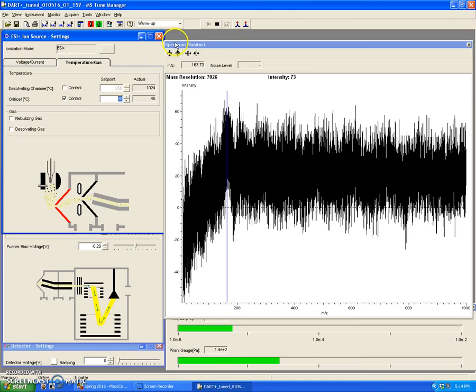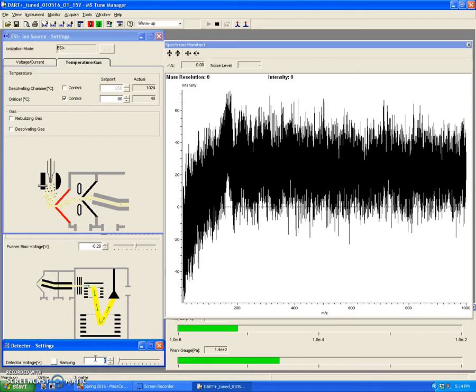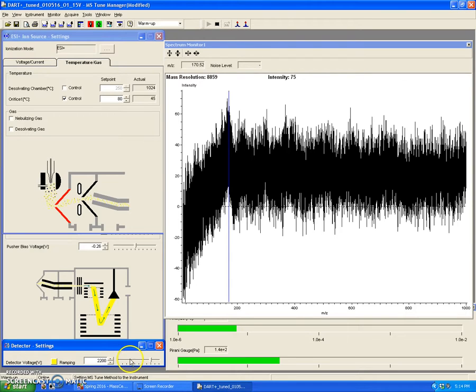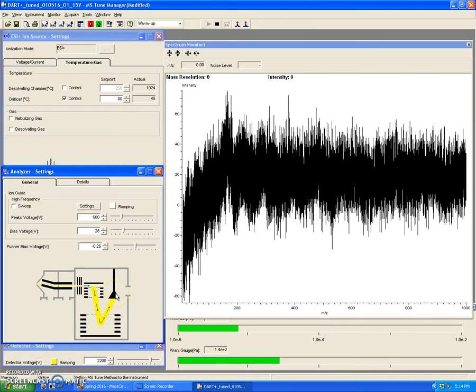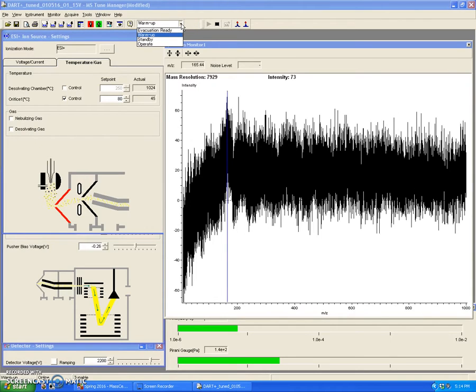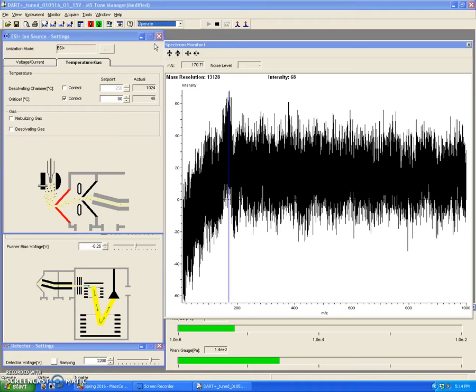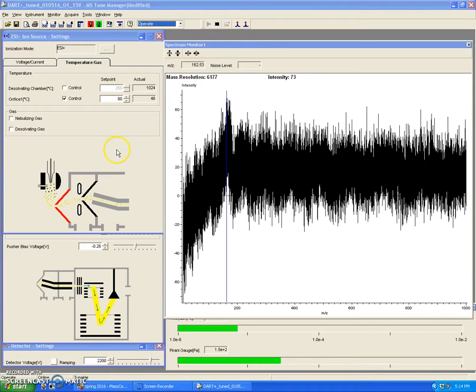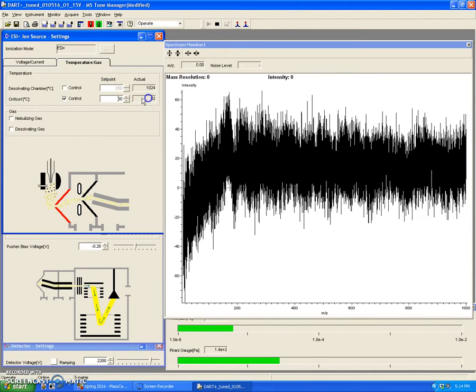So the first thing that you're going to do is turn on the detector. So you set that to 2200 volts, 2200, and press enter. So make sure to press enter to change the voltage of this detector over here in this region. The next thing that you're going to do is go from warm up to operate. And you'll hear the instrument click, and that means a connection was made to turn the voltage of the fast flight and the orifices on to start the heating process.